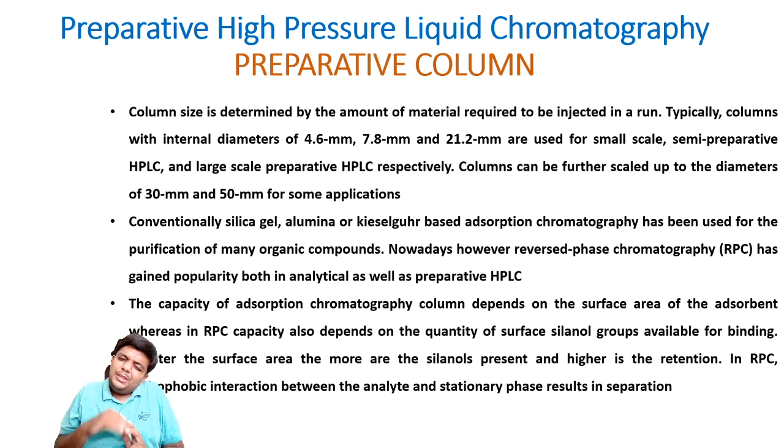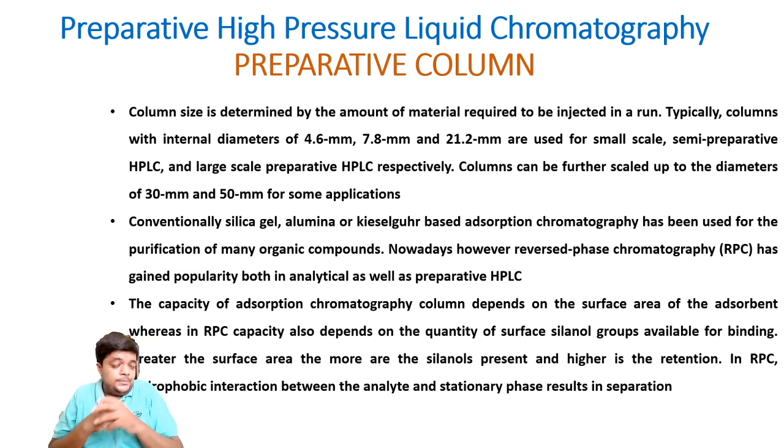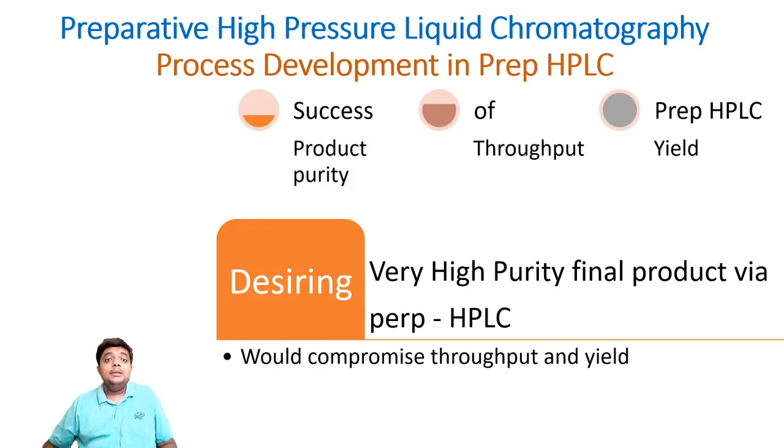Friends, in the basic chromatography section, there were 11 videos, and in most of the videos earlier, I have always tried to mention that the chemistry of your sample and the stationary phase is the key factor in the separation game in chromatography. And a similar thing is revealed here when we are doing this prep HPLC. Let us move a step ahead and see what can be happening.